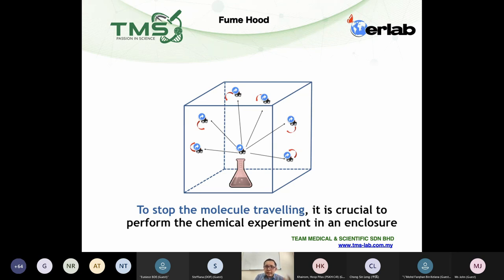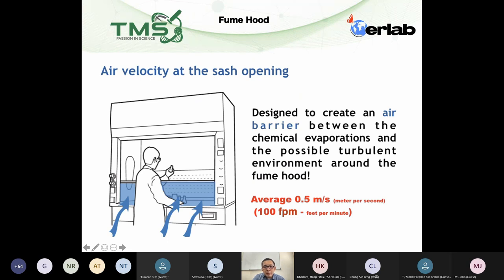That is why most fume hoods look like a box — we call that a containment hood. The chemical should be released inside the box. If you're using a fume hood, make sure any handling is at least six inches inside from the sash opening.